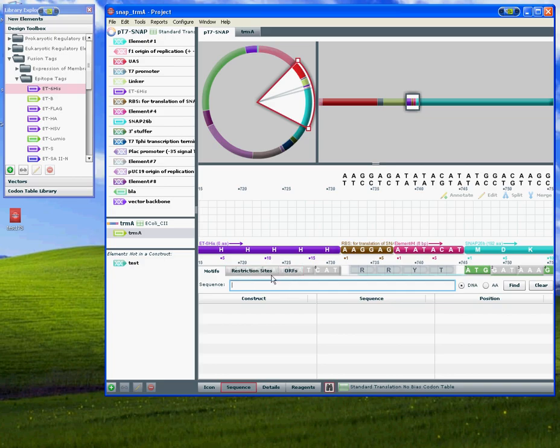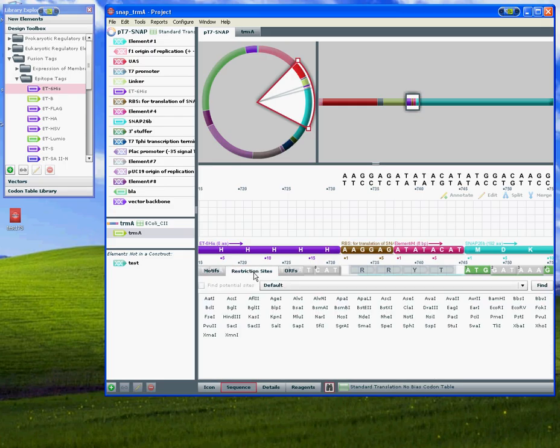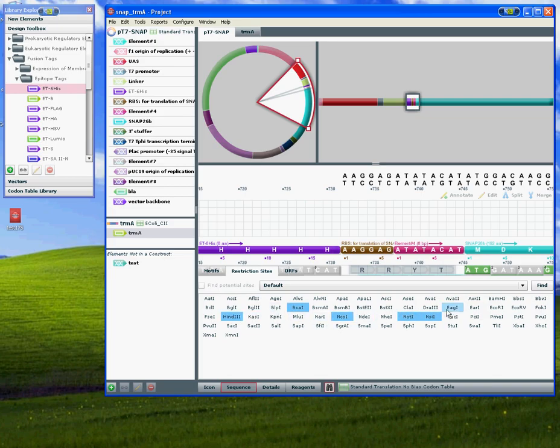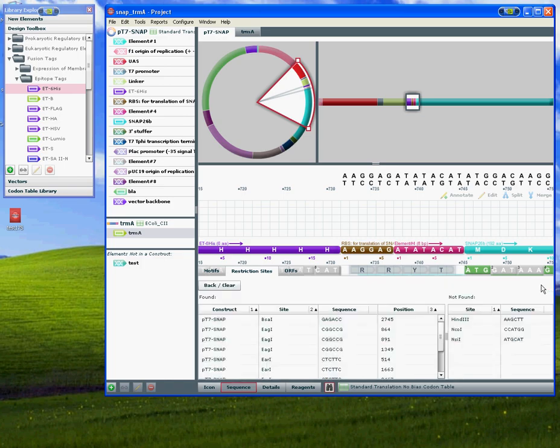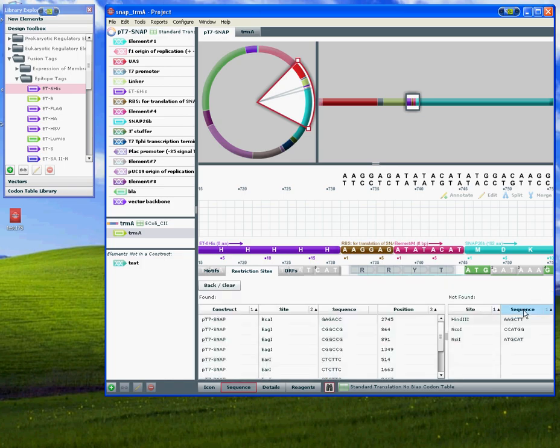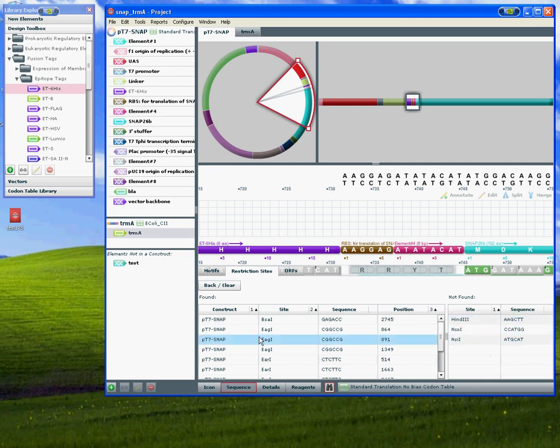So let's go find a couple of restriction sites. Click find. Here's a list of restriction sites not found in the sequence, and these ones are found.